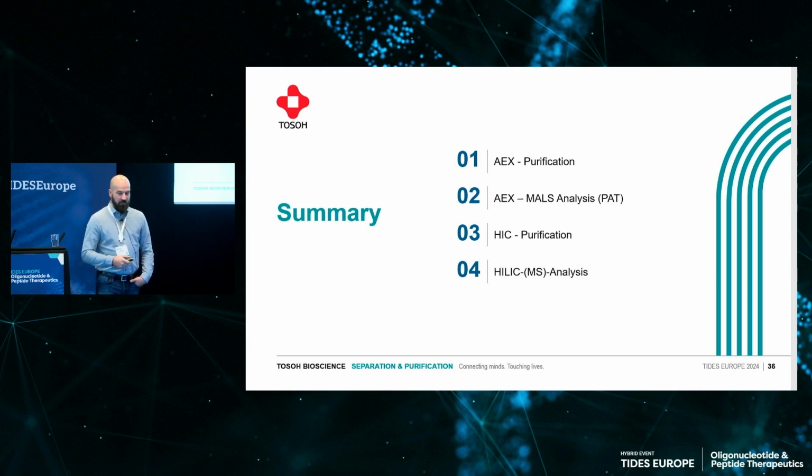We had a short look into the purification of DMT-on oligos using hydrophobic interaction chromatography, and we looked at the HILIC MS analysis.